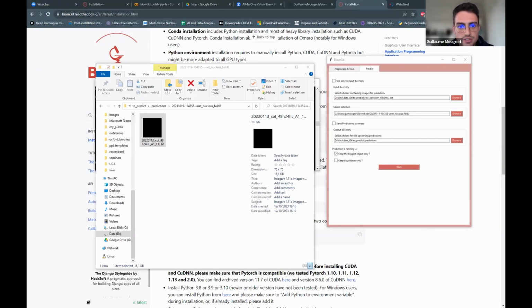Did you try out other architectures or only nnU-Nets? I tried other architectures. I've tried EfficientNet, for example. I had to recode it to be adapted to different patch sizes, but I've tried it. It works better, so it reaches a better accuracy, but at the cost of being slower. You get 1 or 2% higher accuracy, but you need 1.5 times more time.